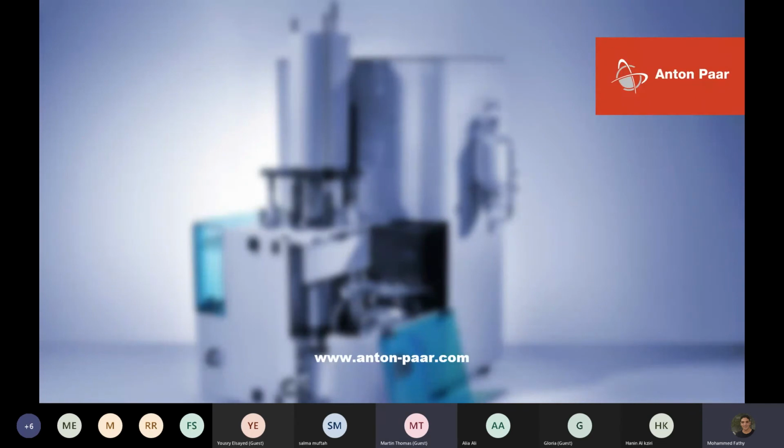Pull the sealing plug down, spin it around. All it takes is fingers just to spin it down, tighten it up. No special tools. Yeah. It's very simple and straightforward.